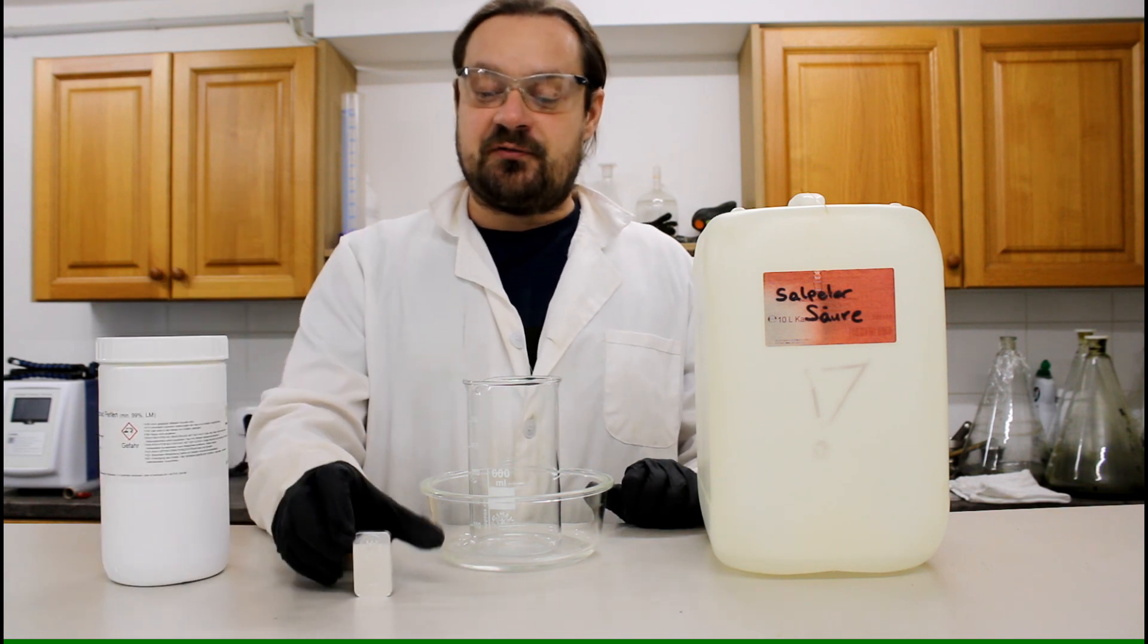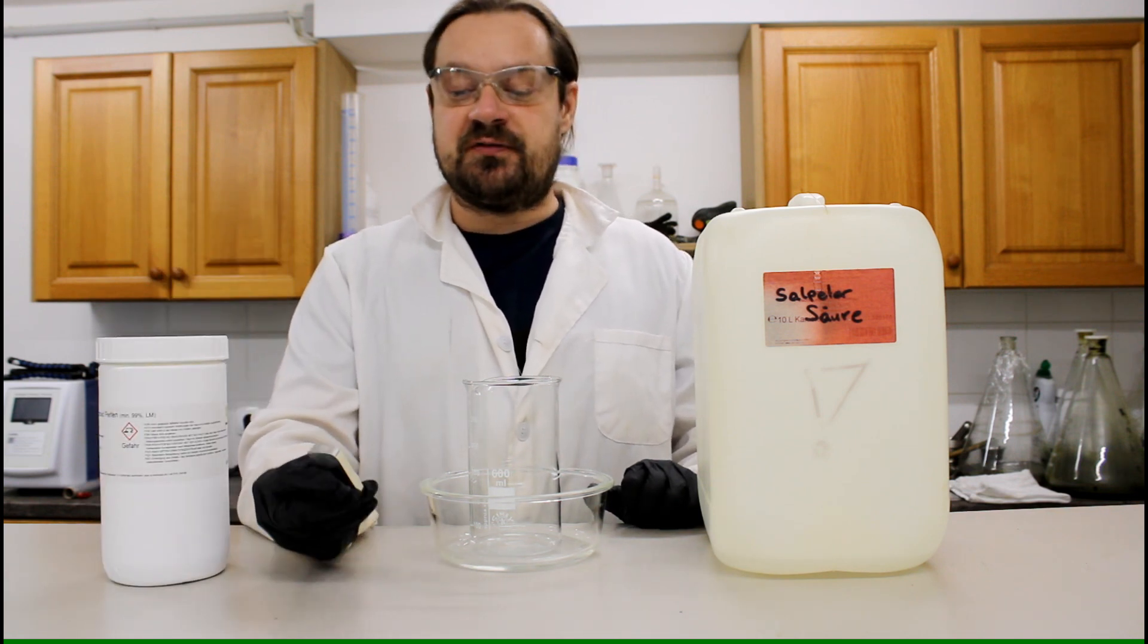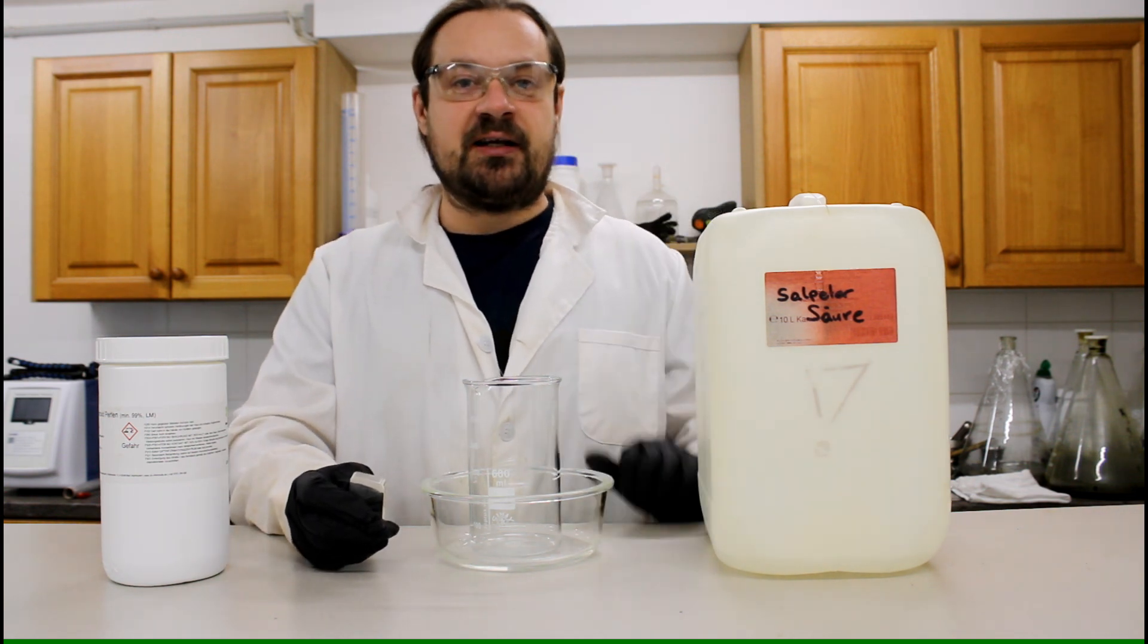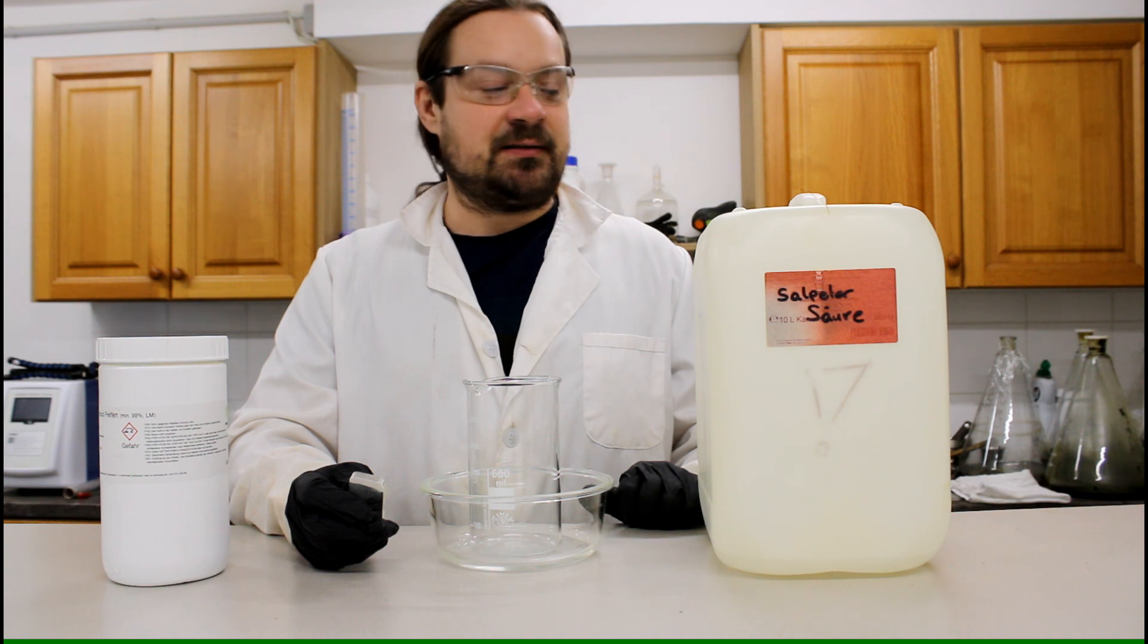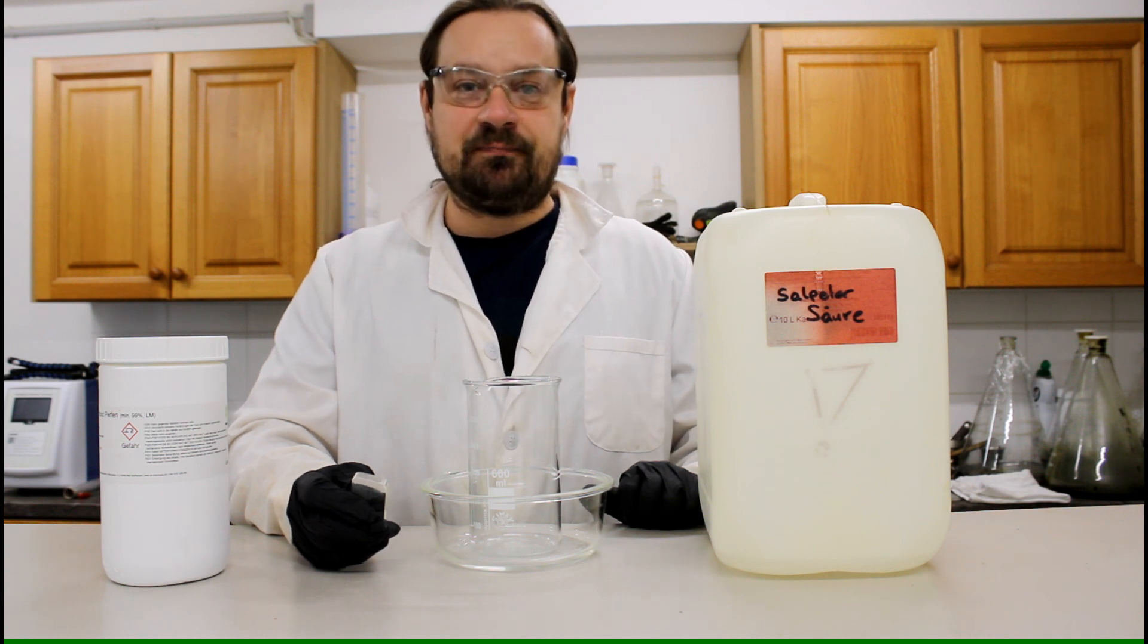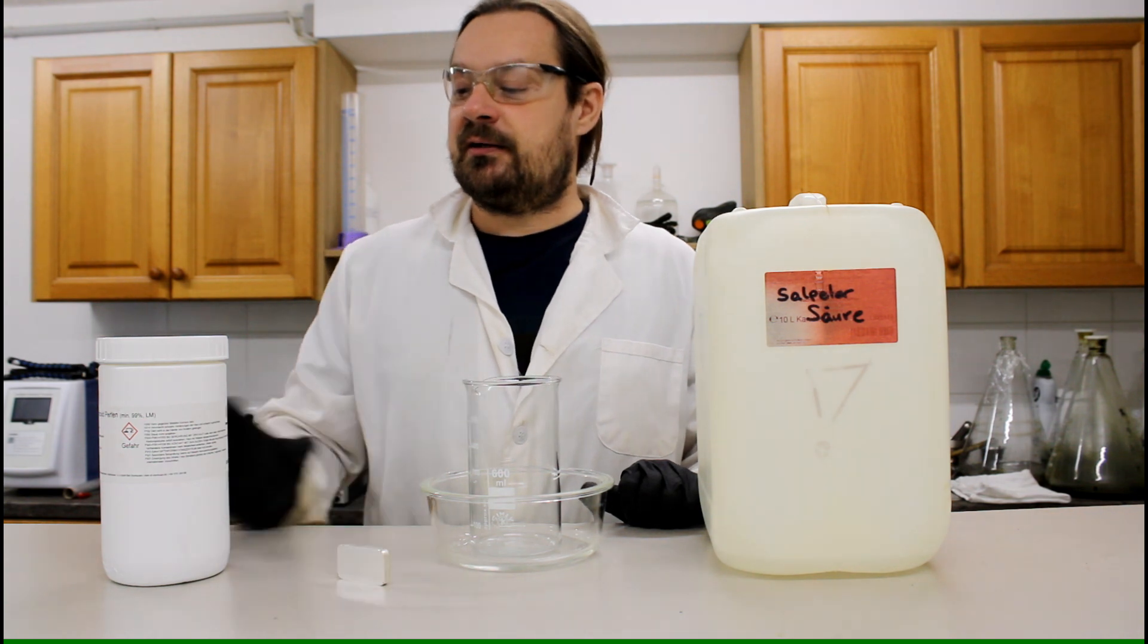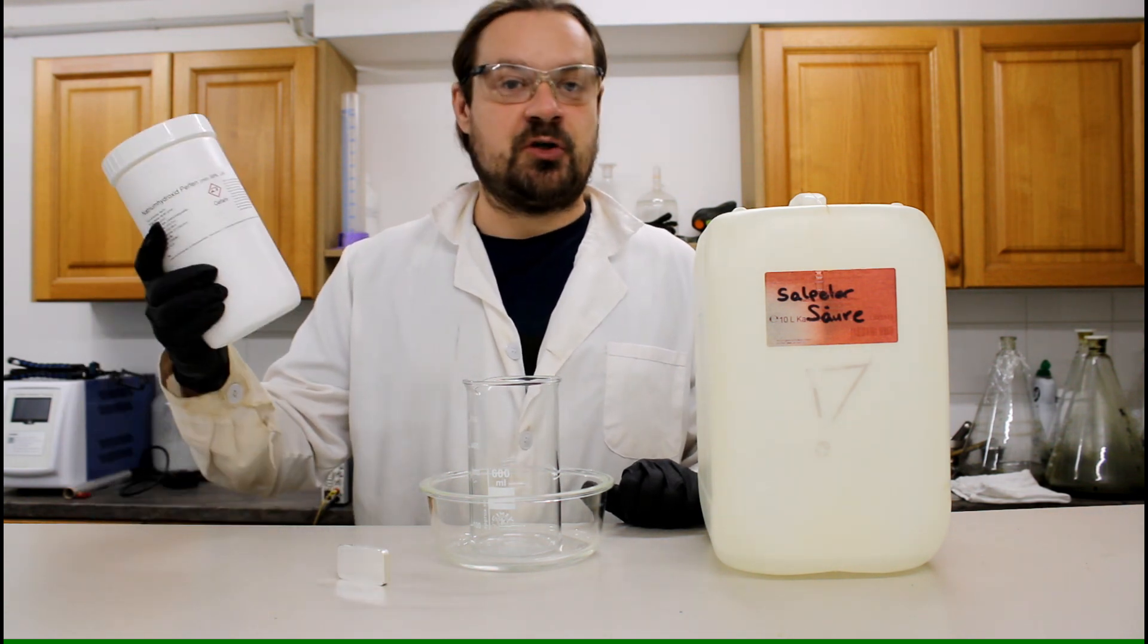To the process, first of all we are going to dissolve the silver metal with nitric acid. Then we are getting rid of the excess nitric acid by simply evaporating it, and then we are producing the silver oxide by mixing in some sodium hydroxide.